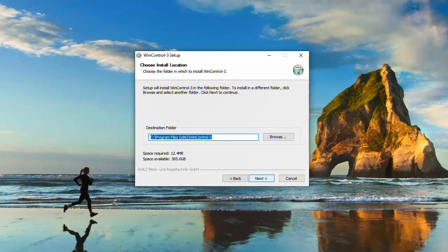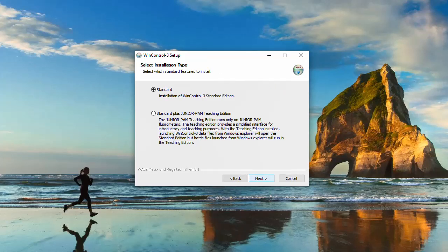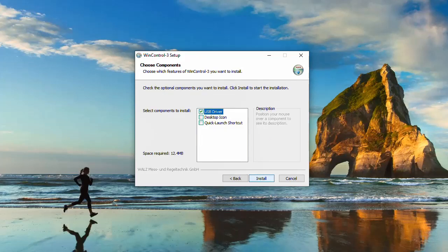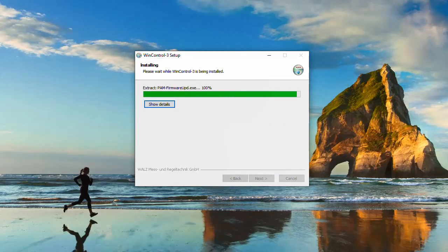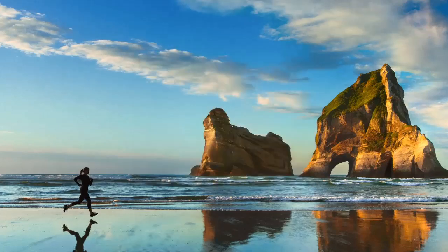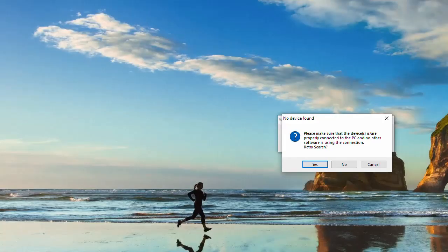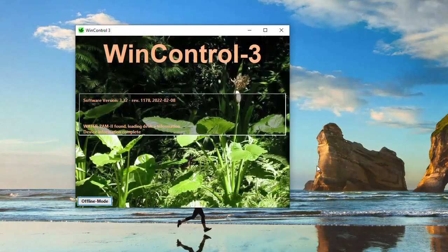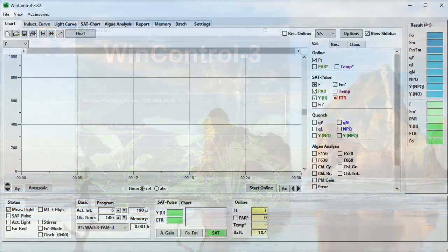After download, the installation wizard will guide you through the installation process. Please choose a destination folder. For WaterPump 2 applications you will need the standard installation type. The USB driver is pre-selected as it is a required component for proper communication with your instrument. When the installation is done you can start using WinControl 3. During software start the program will search for your instrument. If no device is connected you can open WinControl in an offline mode by pressing No. When you click Yes the software will repeat the search for the instrument to open the measure mode.